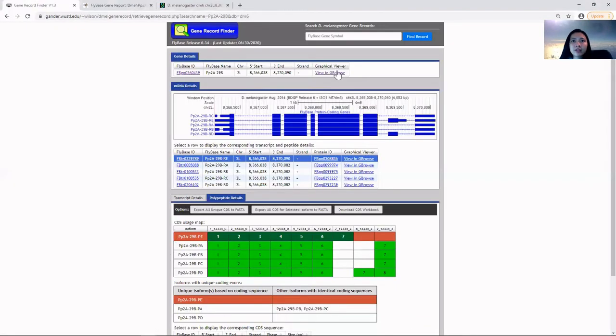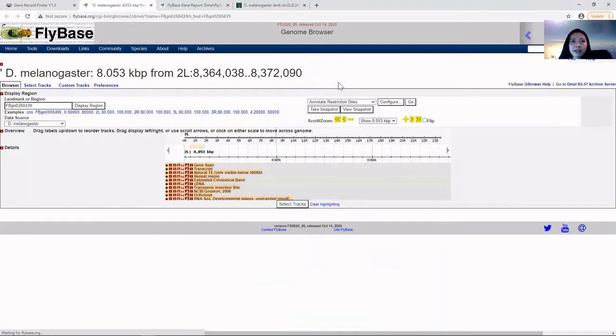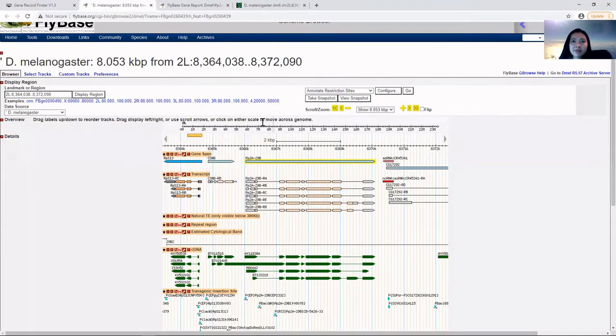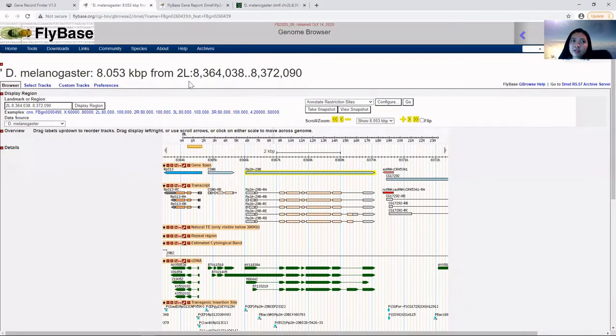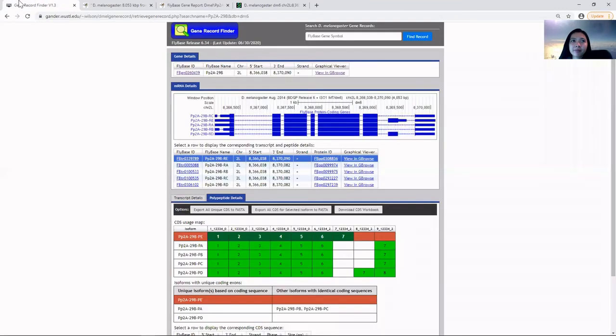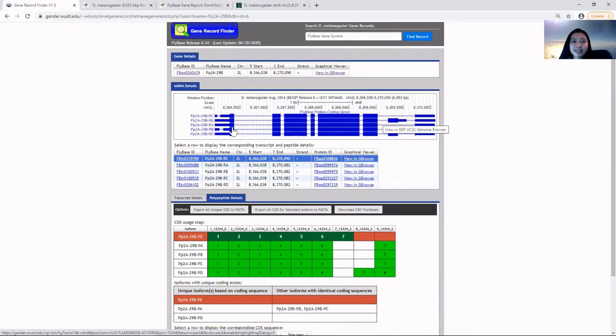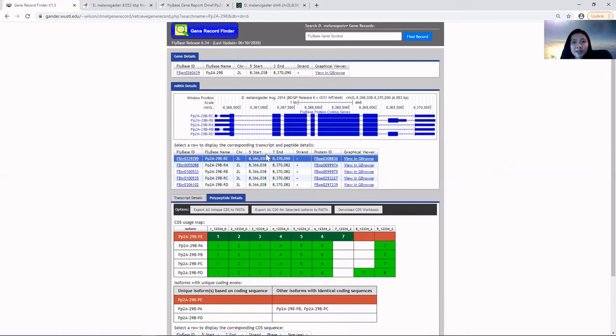If we click on GBrowse, we'll find other mapped features and information regarding this gene. Again, this information is for Drosophila melanogaster, not your target species.